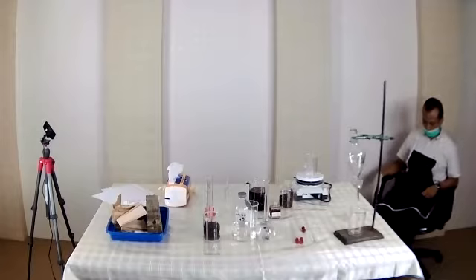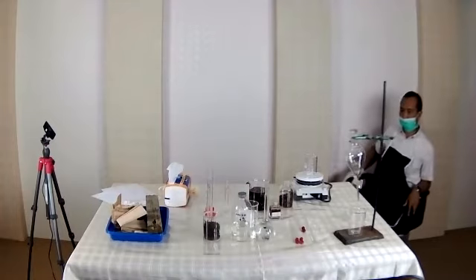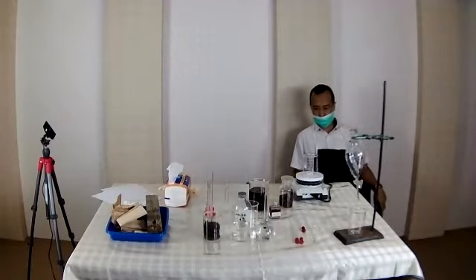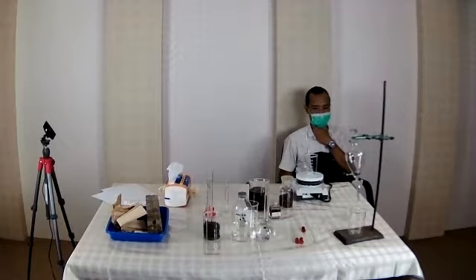Time is running fast, and today is already the fifth day of the course. After discussing traditional conservation concepts for a few days, today we will head to the laboratory for the practice of the traditional conservation methods. In the laboratory, we are going to practice the extraction of natural products for wood conservation.